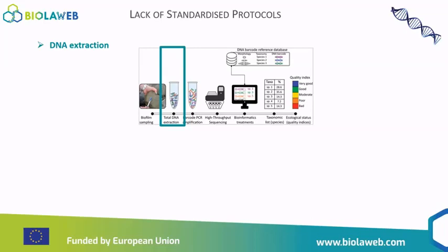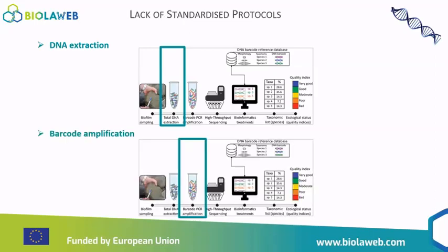Frédéric told you about standards about the sample preservation and sample collection, about the barcode library completion and how it's composed, but we had nothing about DNA extraction, and also nothing about barcode amplification for this metabarcoding process. So we wanted to look a bit better at the different protocols and how different labs could obtain the same results with the same protocol.